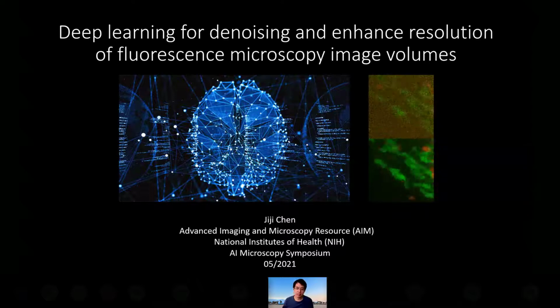So today I want to focus on the recent work we did together with an excellent group from S Vision. Now it's part of the Leica system. The development of deep learning methods for denoising and enhanced resolution over three-dimensional imaging volumes.